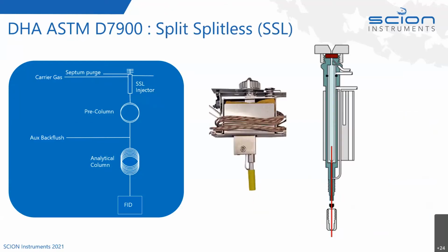So here's the injector itself. This is our standard splitless injector. Very much like the cold on-column injector, it has a very short nozzle that protrudes into the oven, with low dead spots and cold spots. Now, unlike the cold on-column, it's not a programmable heater that's attached; it's isothermal. It's quite a large liner volume inside this injector, approaching 1 mL maximum. So it's a large volume liner inside, allowing very capable splitless. What's quite unique about it is it has a split vent line at the top of the injector and also one at the bottom. So that makes the solvent tail for the split and splitless injections very sharp and well defined.